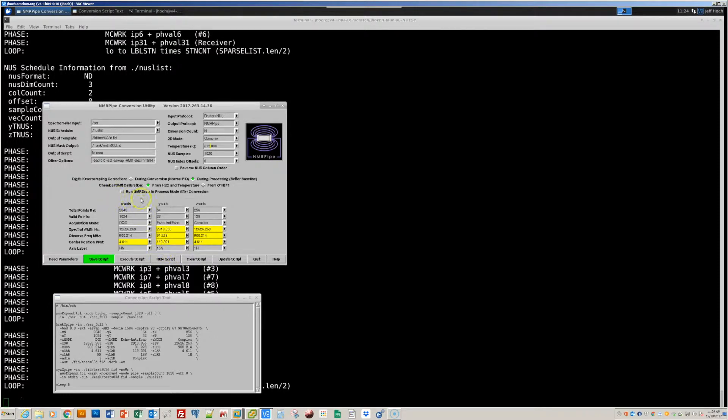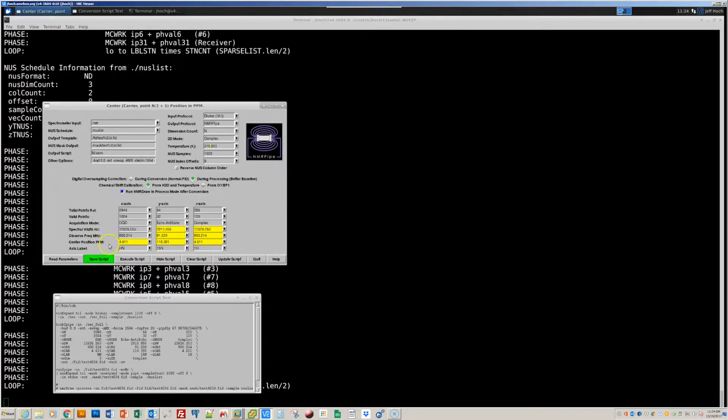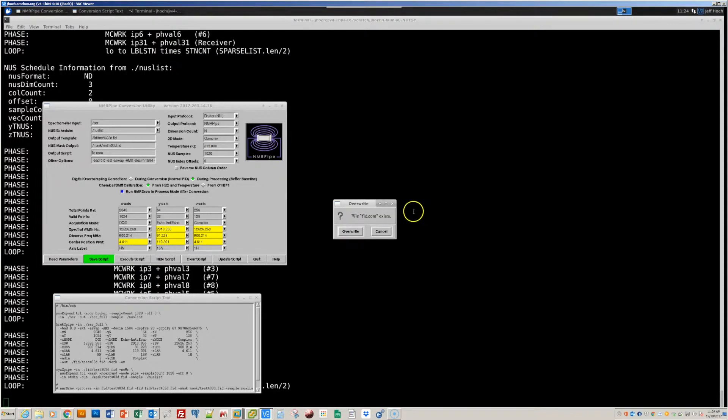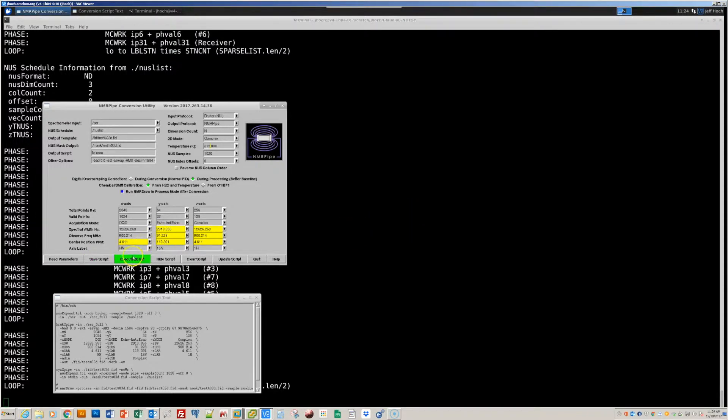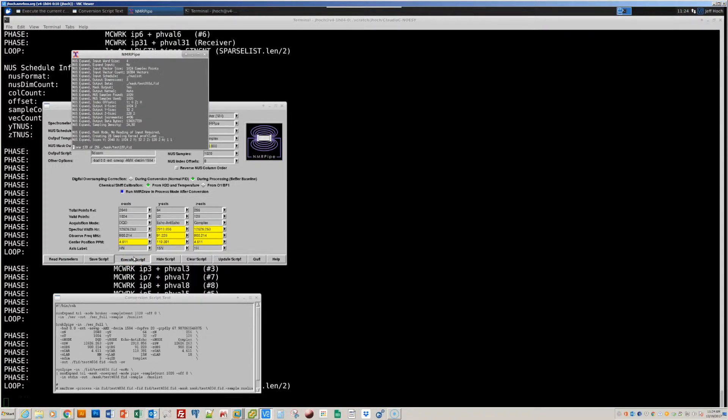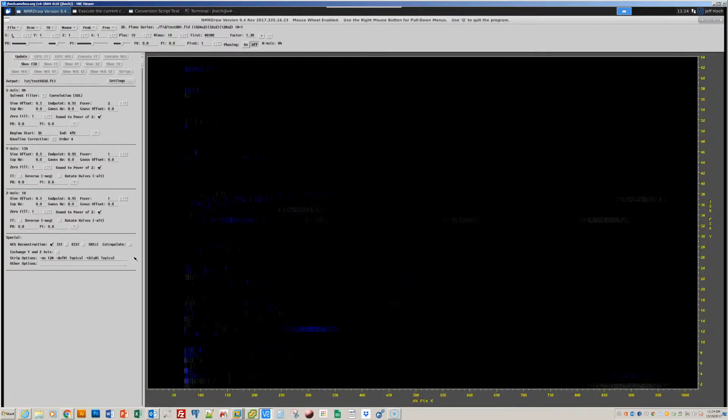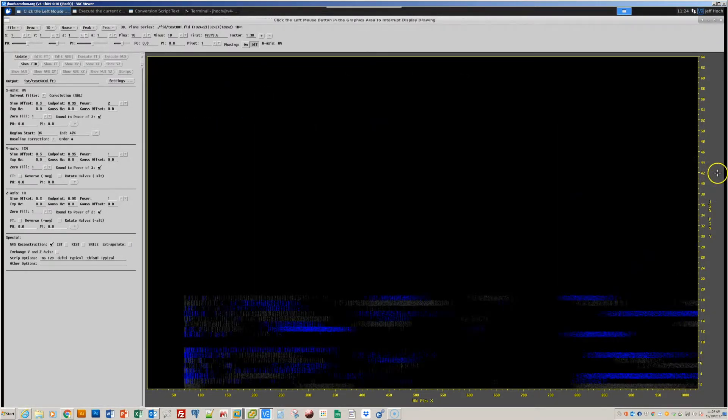You will also notice that there is a new checkbox in this interface that says run NMR draw in process mode after conversion. So I'm going to click that. And after conversion is done, that will start the NMR draw graphical interface with a new processing environment for generating processing schemes for conventional and non-uniformly sampled data. So I'll save this processing script on the disk, and then execute it to convert the data from the spectrometer format to the NMR pipe format. And when the conversion is done, the NMR draw program will be run with this new graphical interface.